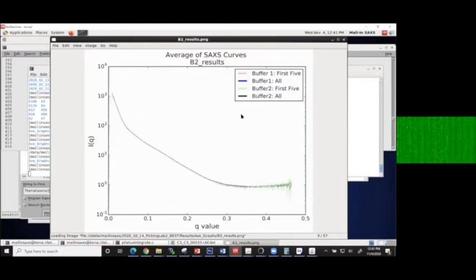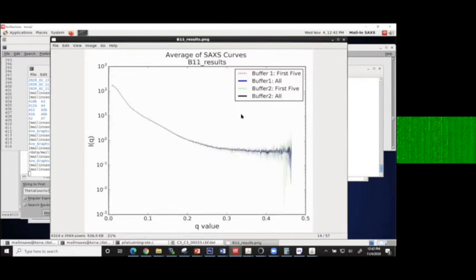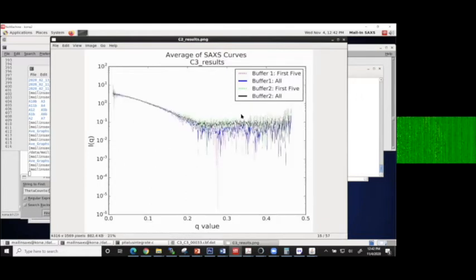And here are just sort of the results from the processing. And again, you're looking for differences between buffer 1 and buffer 2. You know, how things went. So it's a general collection thing. So look through those. For example, here's another little issue that you can see immediately. All right, so closing that out.